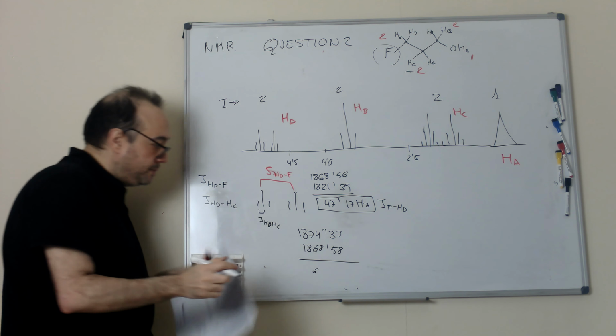while the coupling constant between these two will be the bigger one. We can calculate, if you want, the coupling constant between the two big signals.